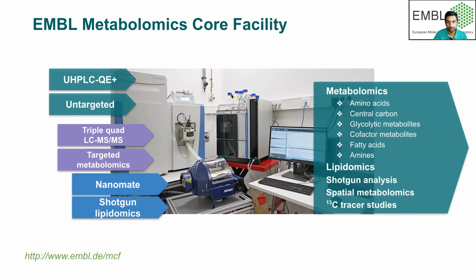Okay, yeah. So this part, if you can see with my right pointer, is the LC. This is a mass spec. Basically, what metabolomics or any of this analysis consists of is that you extract your metabolites and put them into your LC system, which is a chromatography or separation system, and the mass spec acts as a detector. So your metabolite gets separated, so you will have a cleaner sample and more resolution.